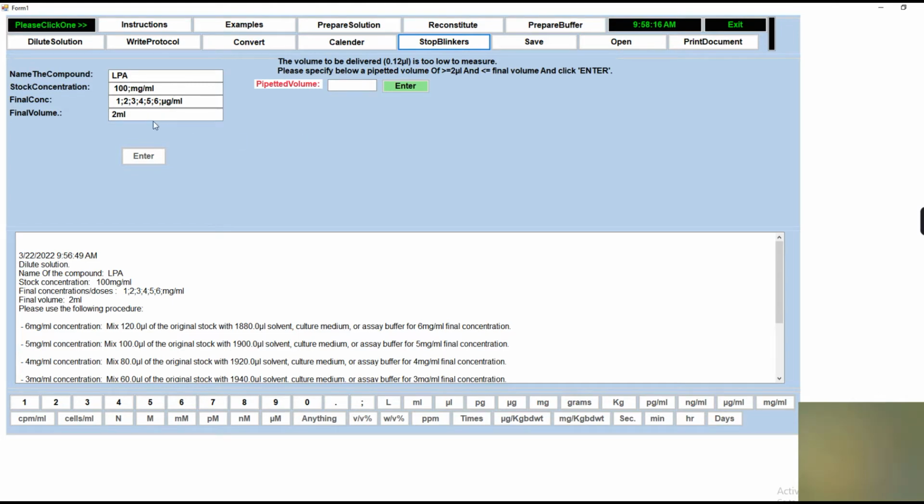These multi-step dilutions are called serial dilutions, and so far the serial dilutions are designed intuitively, case by case, depending on the scenario. With that approach, it is very difficult to program, because we have to generate millions of lines of code, and even after that the programming will be restricted to special scenarios.